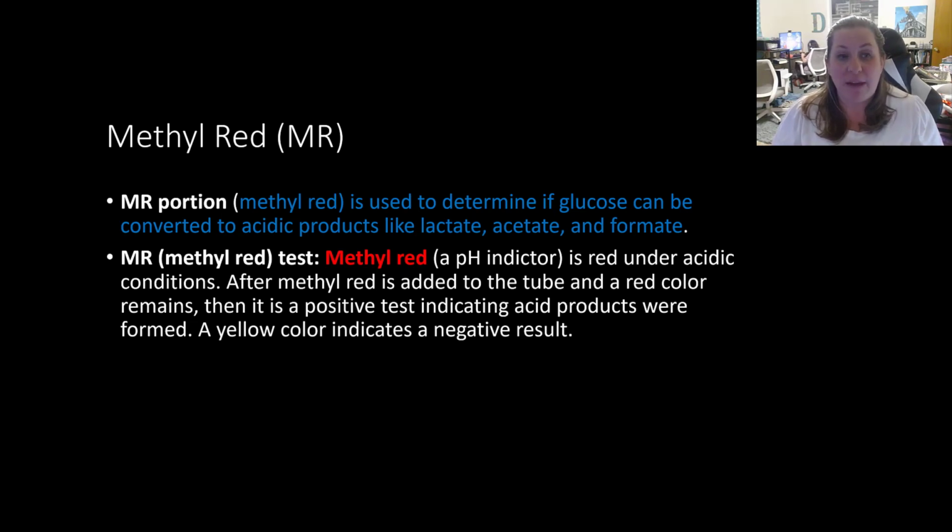After methyl red is added to the tube, and a red color remains, we say it is positive for the MR test because methyl red is what we're looking for, so it's positive.